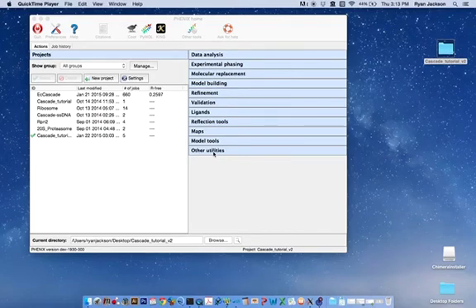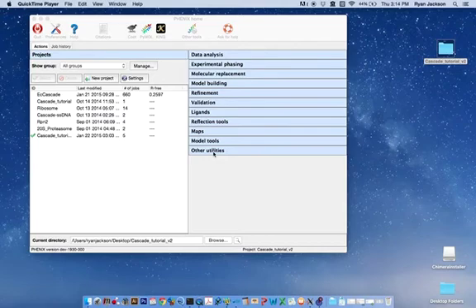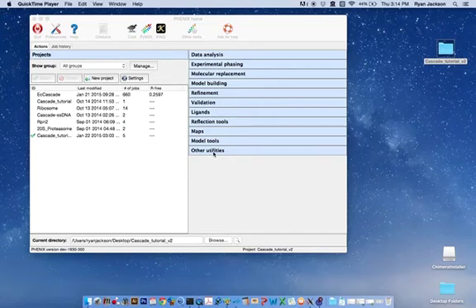This is Supplemental Movie 4, which is a tutorial associated with the Nature Protocol X-ray Structure Determination using low-resolution EM maps for molecular replacement.